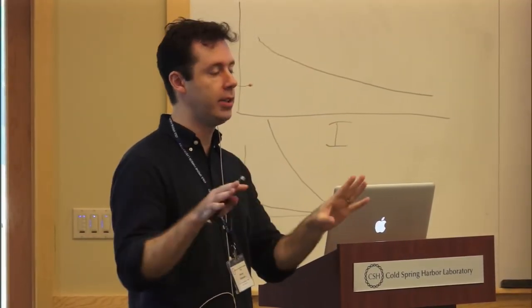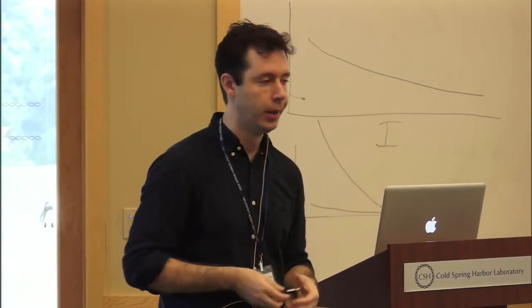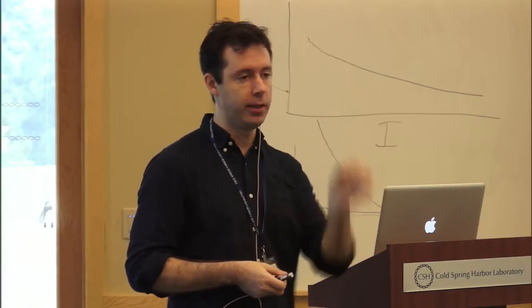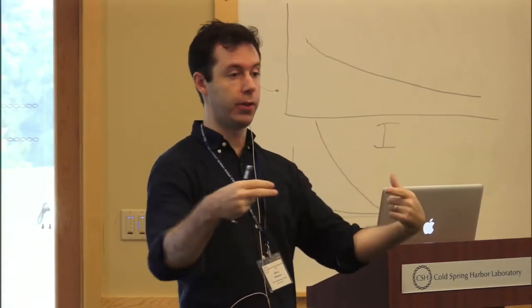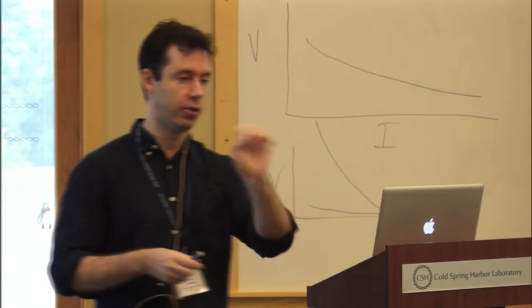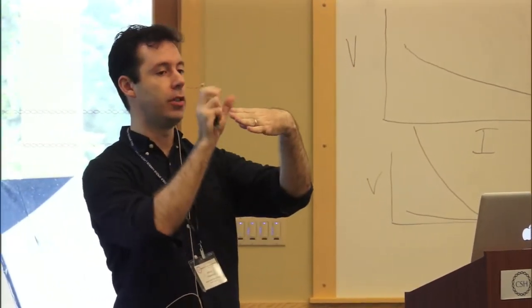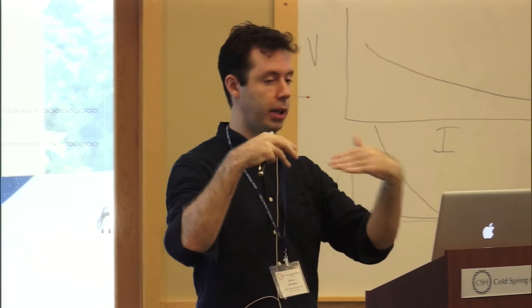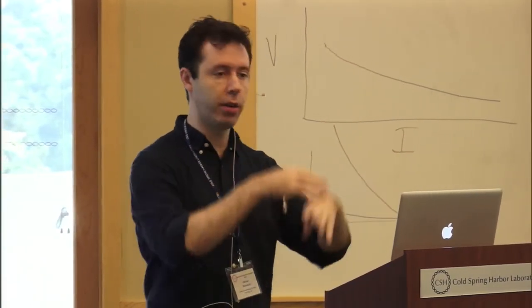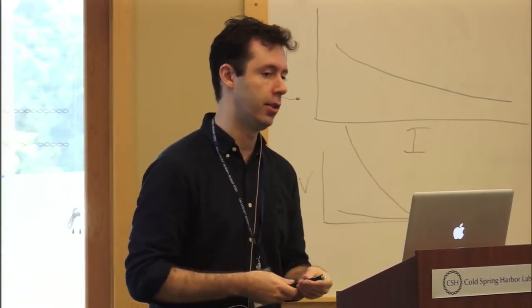I mean, repeats are problematic for many, many reasons. When doing alignment, when you have microsatellites, short reads with multiple copies of the same repeats like CACACA, if you align them to the genome, and the genome has a polymorphism, it has a different number of CACACAs, right? It has just one CA insertion, for example. If you have multiple reads that you're going to map to the same location, the location of the insertion or deletion in the reads, because it's different from the genome, is not going to be at the same location between the reads, because the alignment is done one read at a time. And that's creating all kinds of problems in terms of indel detection. But it's not so much the technology; it's more the software itself.